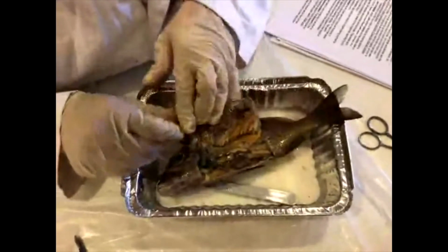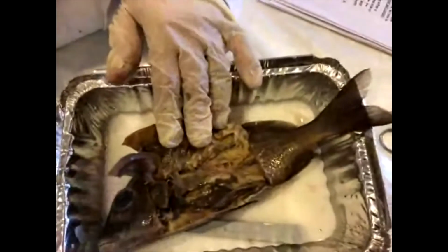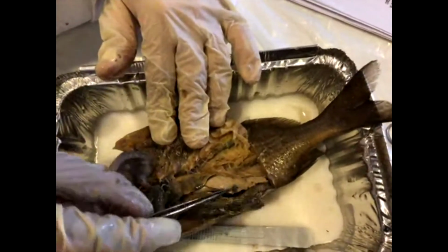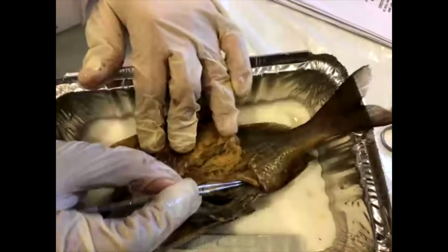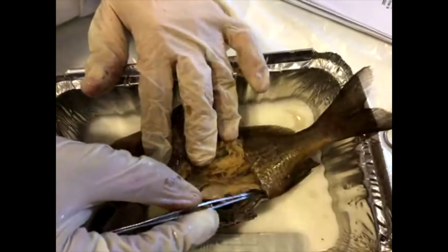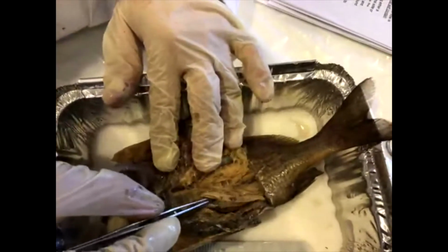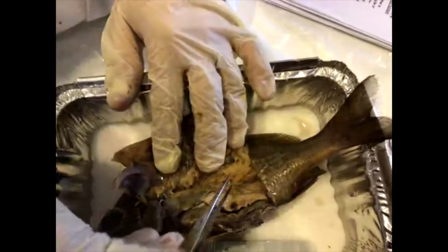Okay, so we now can start to see the internal anatomy of the fish. So one of the first things that we'll notice, I cut into it here a little bit, is this fish to me looks like a male or a not mature female. Now we're talking about the biological sex here, and we can usually tell sex by maybe the different body structures that an organism has, but there's also a lot of different things that determine sex, and that can include hormones and body parts and all kinds of different things. So what I'm looking at right here is part of the male reproductive organs.